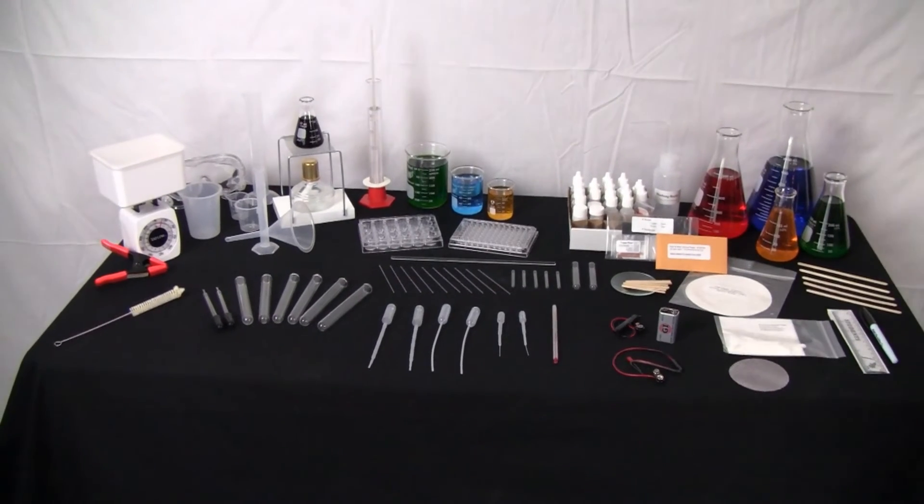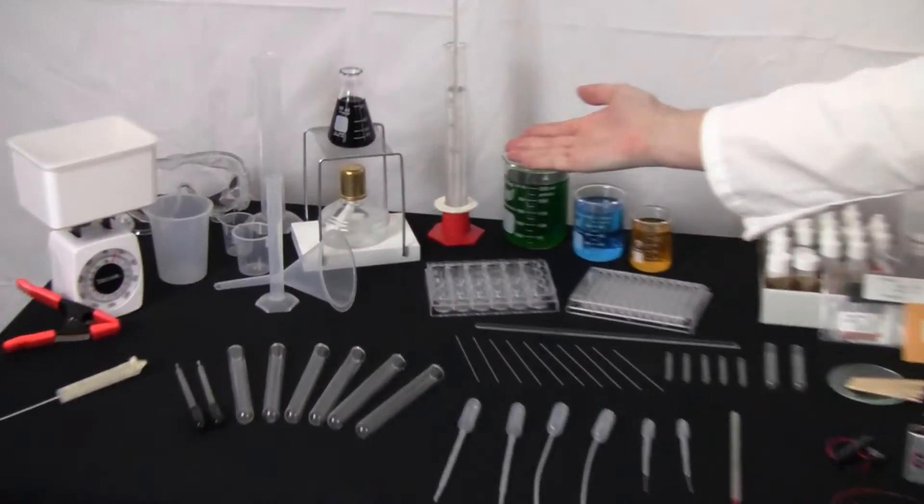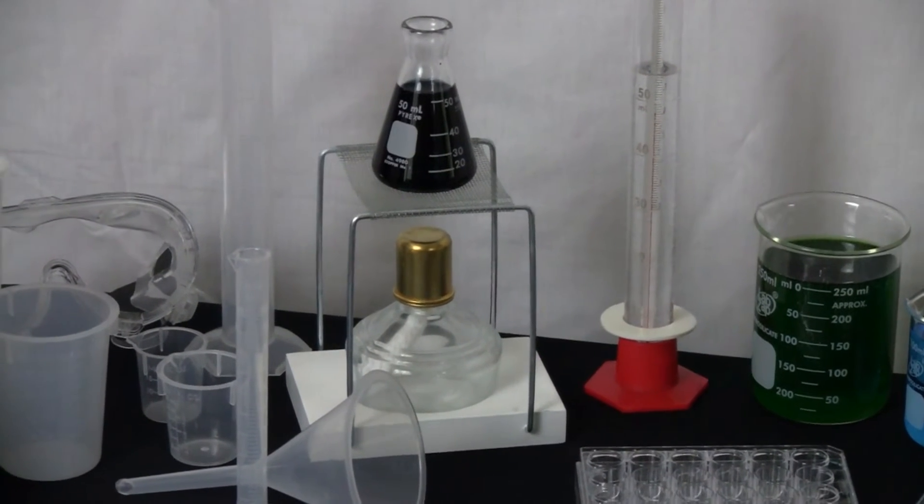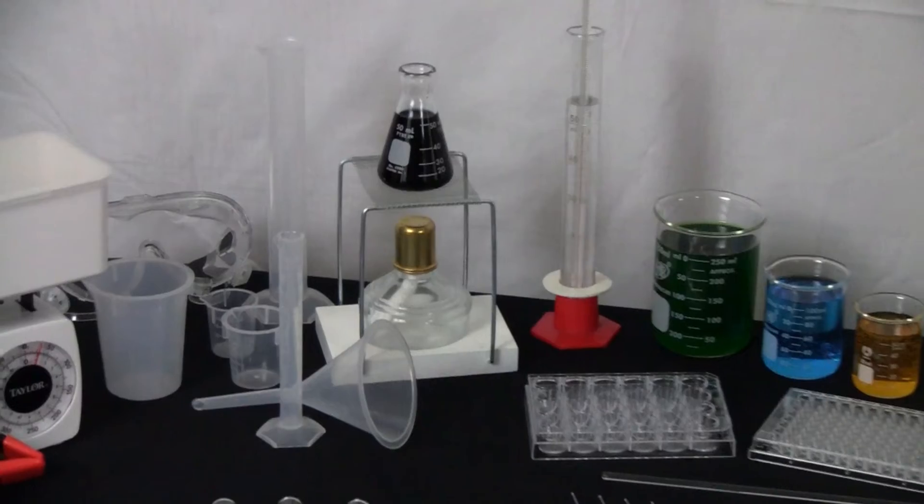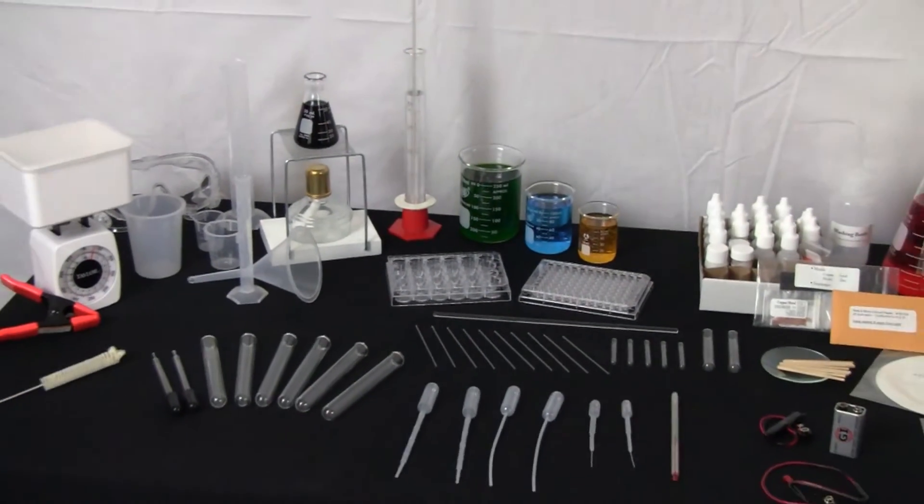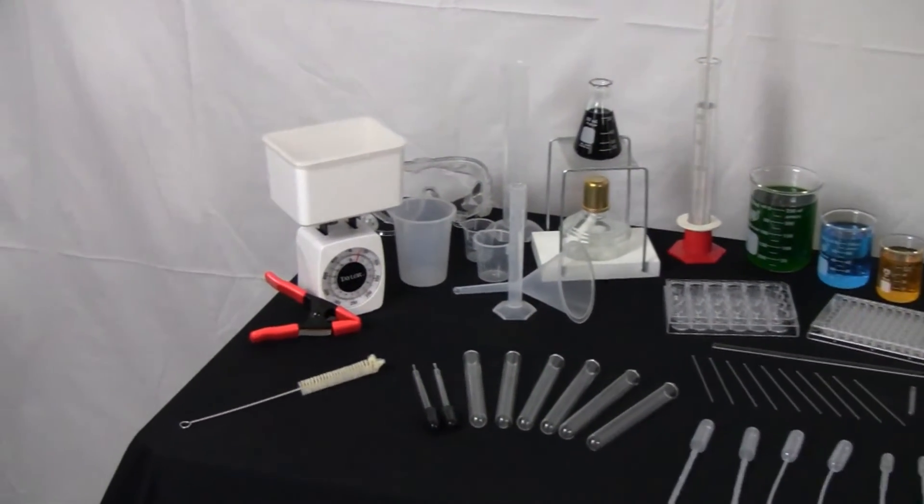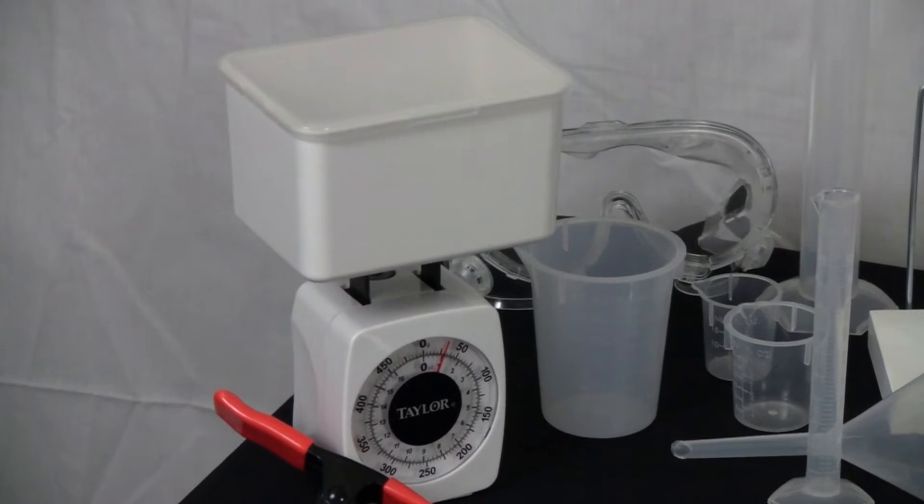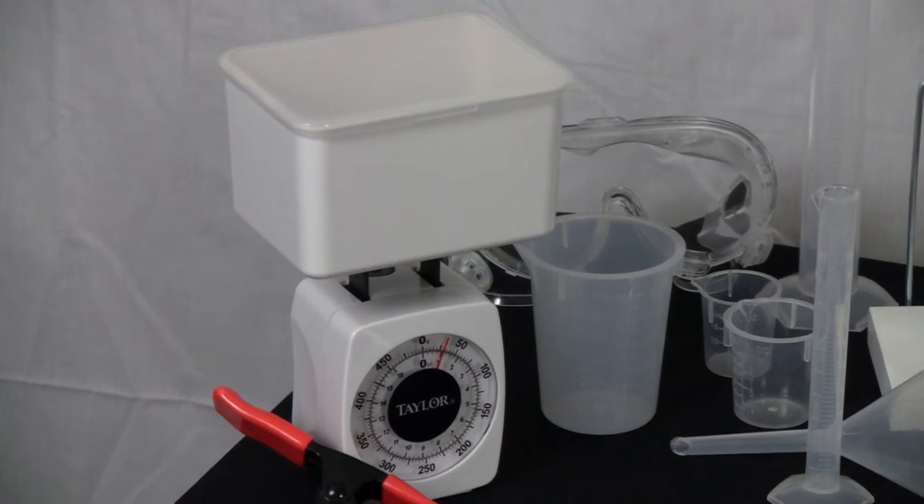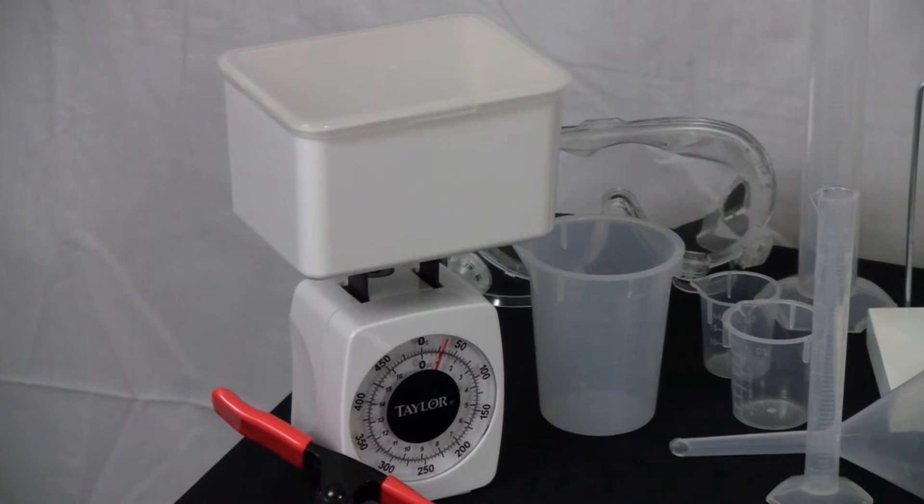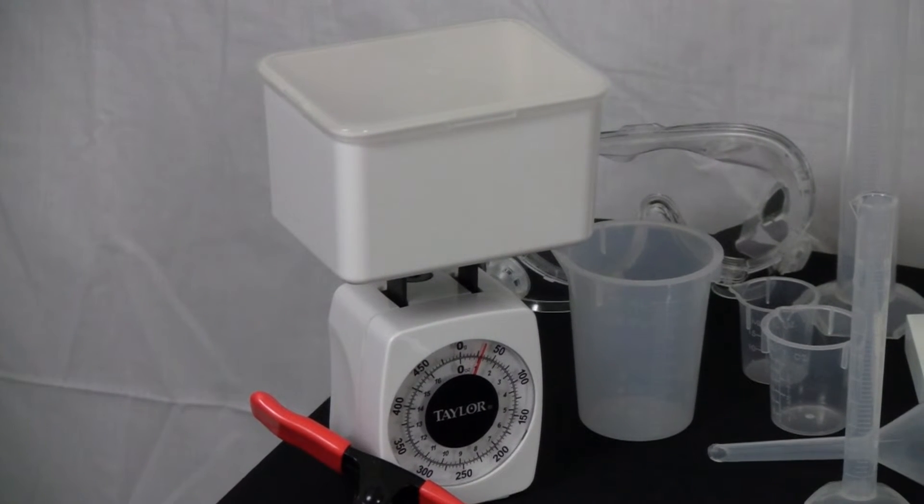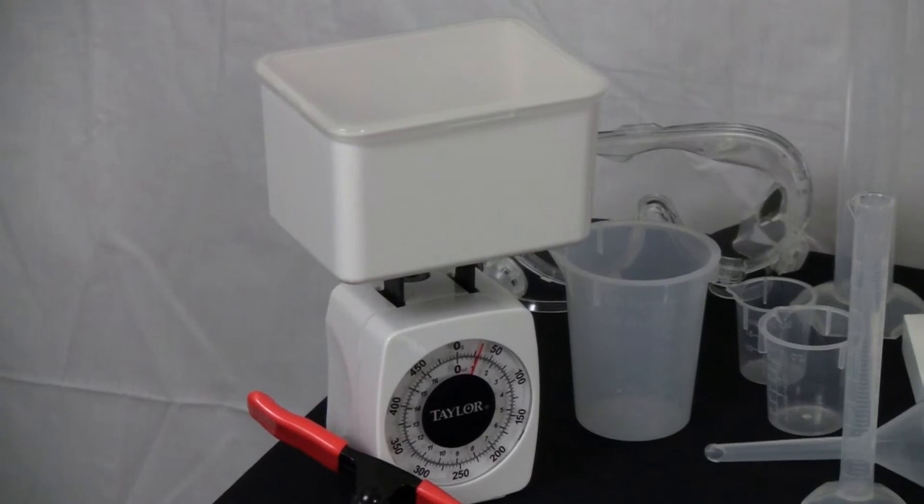And we do have a burner. It's not a Bunsen burner, but it is a burner. And that is used for heating up different things in chemistry. And then we also have a scale. If you take a look at that scale, you can measure how much something weighs, maybe before and after an experiment to see how much maybe evaporates or whatever. And so, a scale can also be useful for chemistry experiments.